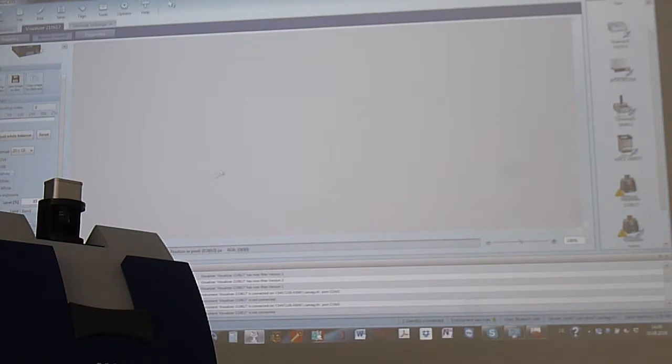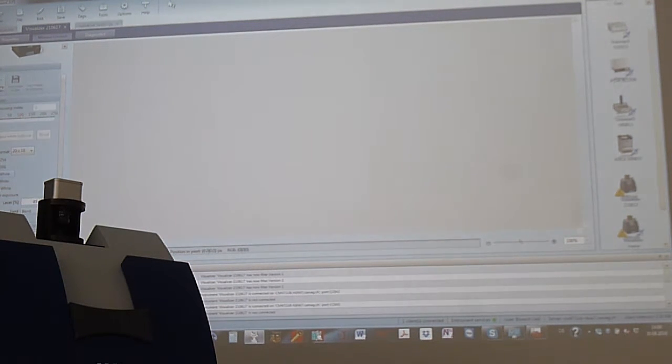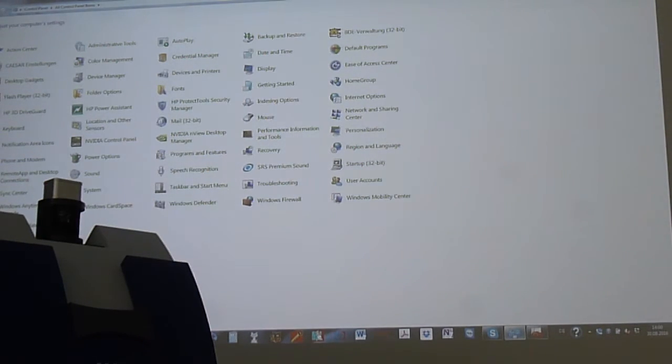Right, yeah, because you have selected there. And now you see no problem. You don't have an image. No picture. But everything is okay. So this is a classical thing of power drivers and FireWire. If I add a new camera to an already existing system, sometimes the drivers need to be newly installed. That's very good. So we can go through that as well, because this is also a very important thing.